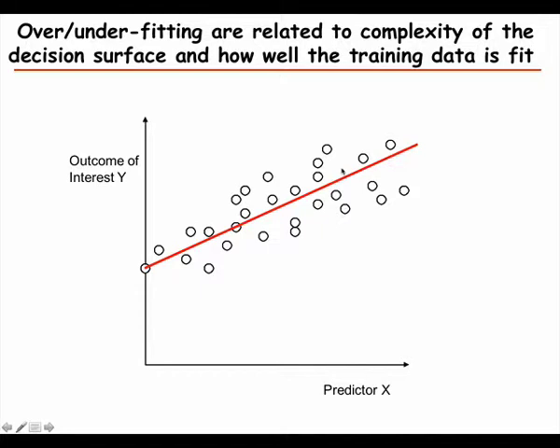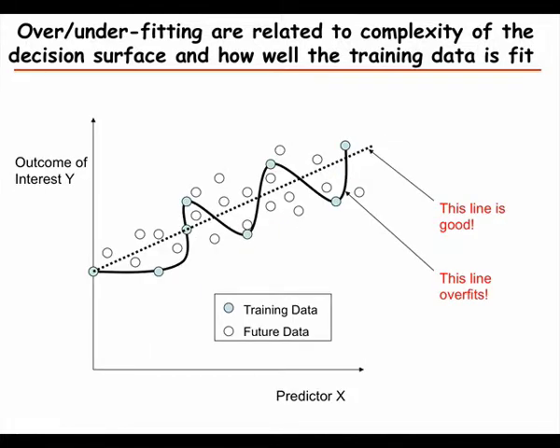But if we would start with much fewer points, so we've only measured these points, the blue ones, then if we fit a curve that goes through all the points, that would be very bad for predicting what the other data points are. But if we would just fit this line, that would be a much better description of the data.